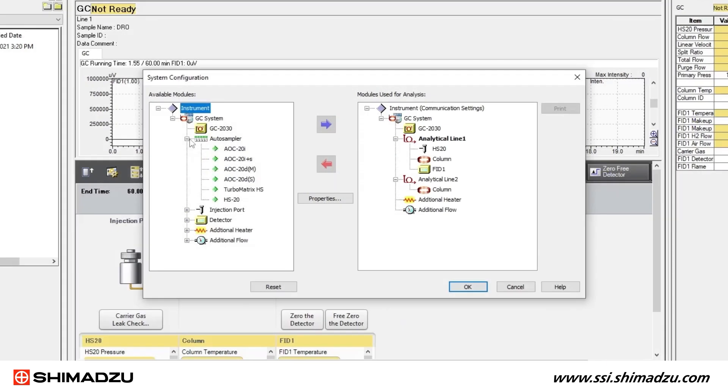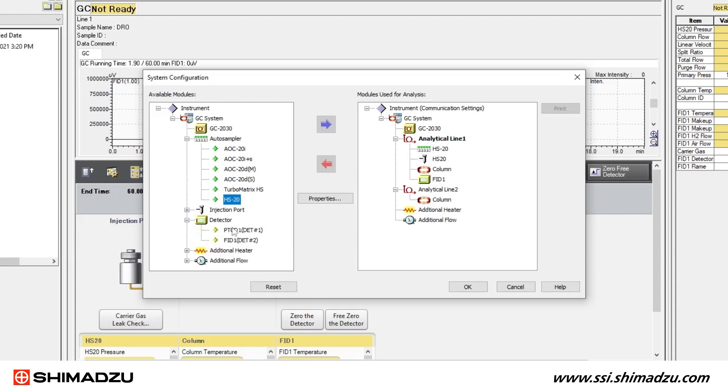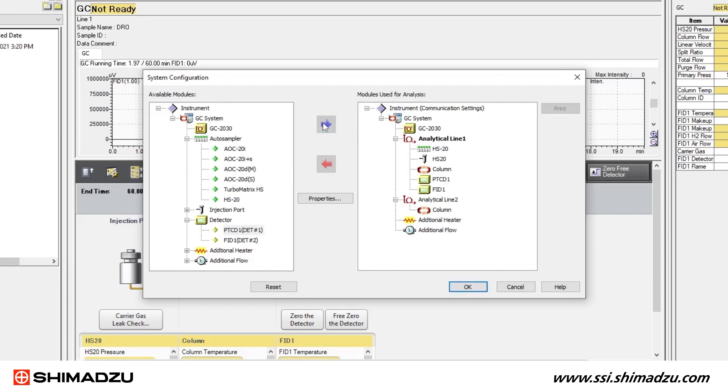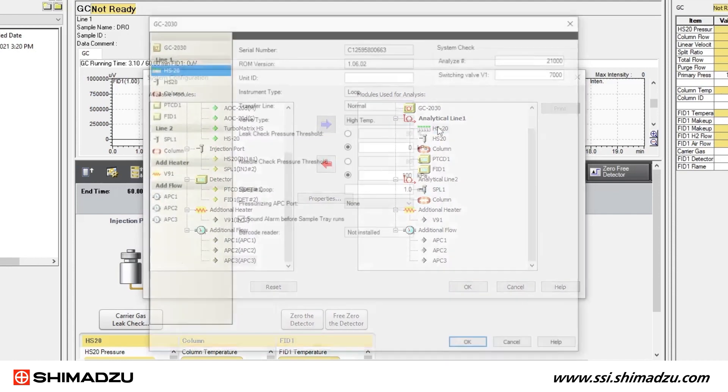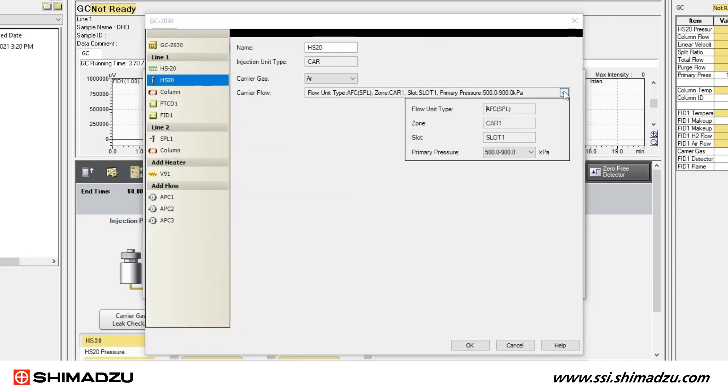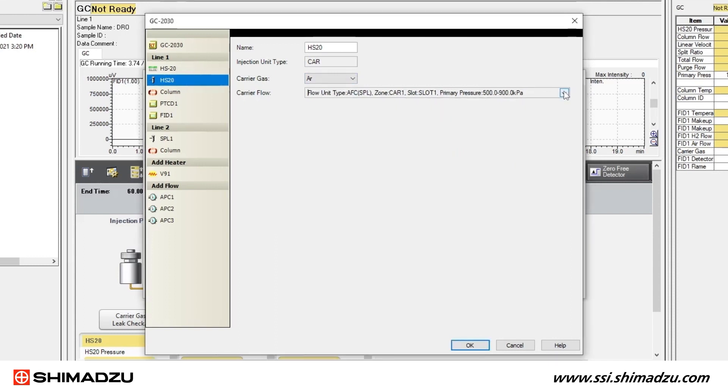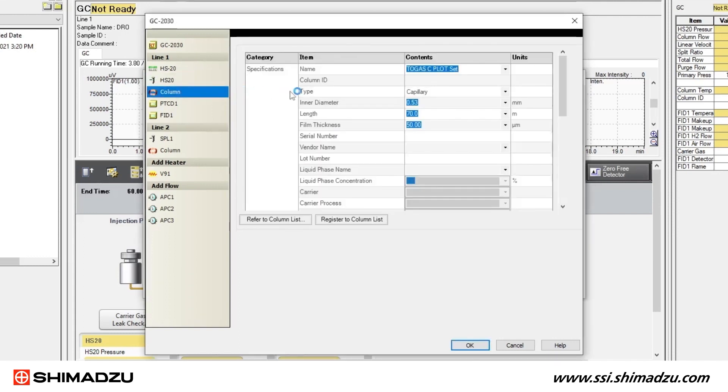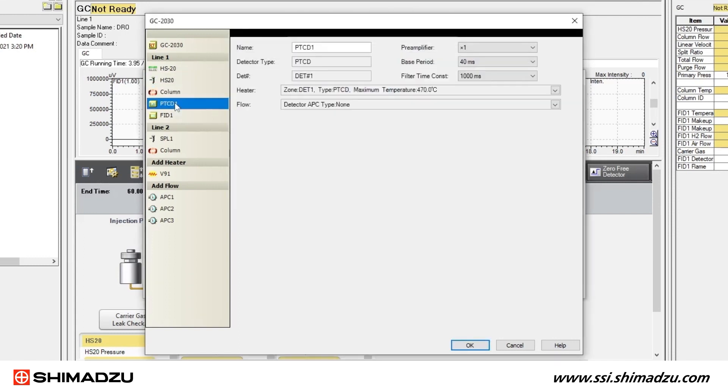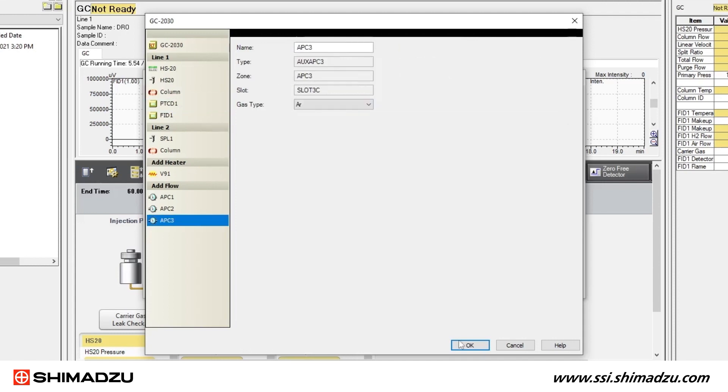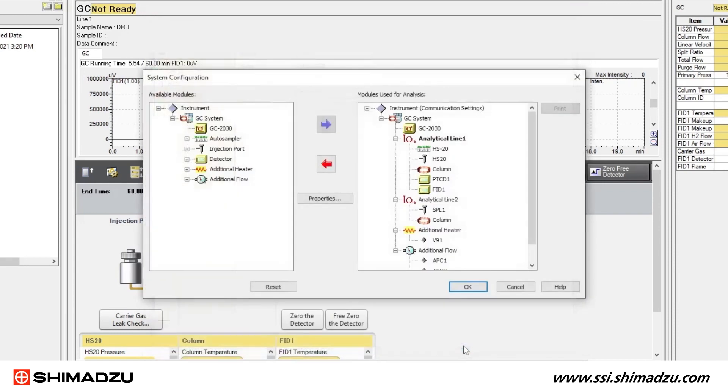Use the red and blue arrows to add or delete modules from analytical lines to match the configurations you recorded earlier in the configuration process. Double-click any of the modules to open detailed setting windows for the GC and each module. Enter the information you recorded. Click OK and you should hear a long beep from the GC.